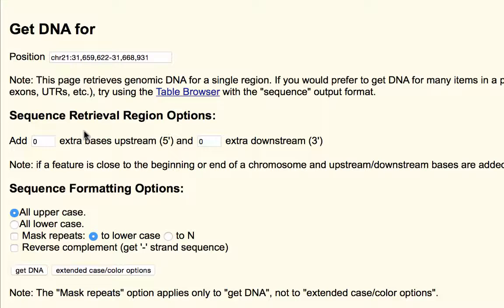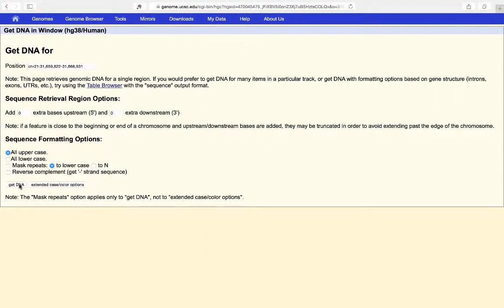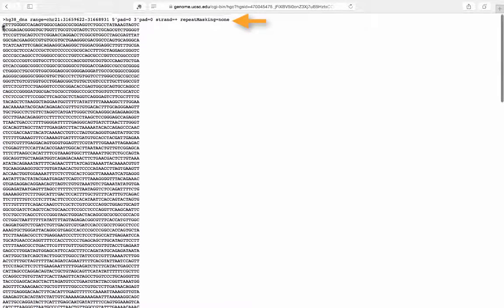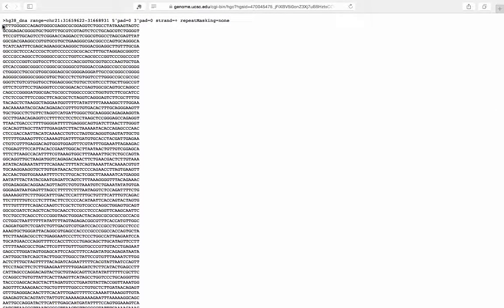Under sequence retrieval options, you can add extra bases upstream and downstream if you wish. There are formatting options: all uppercase, all lowercase, mask repeats, reverse complement, etc. Clicking 'Get DNA' produces the raw FASTA file with a FASTA header followed by the raw DNA sequence below it, covering the entire window that was being viewed.